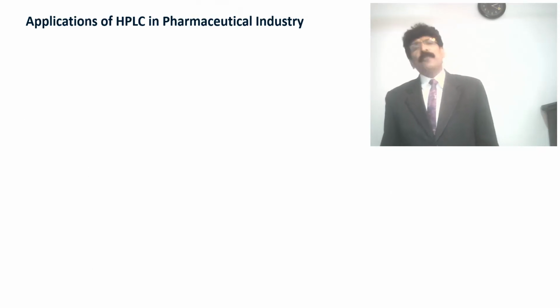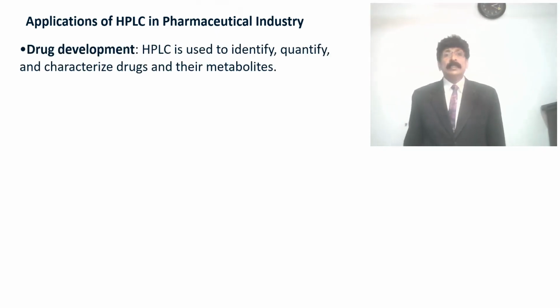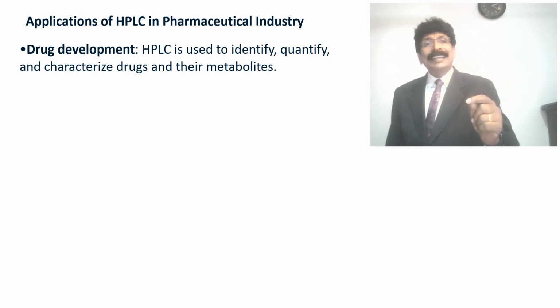Application of HPLC in the pharmaceutical industry. Drug development: HPLC is used to identify, quantify and characterize drugs and their metabolites.